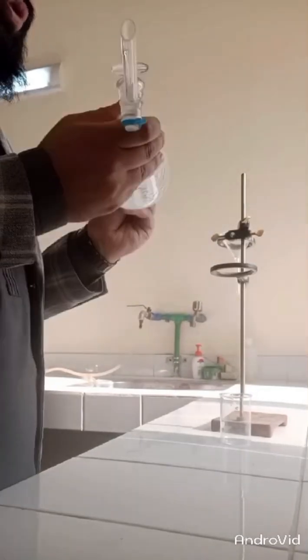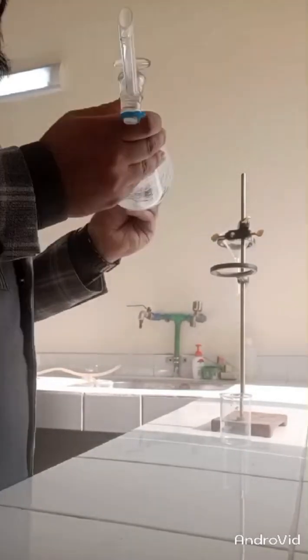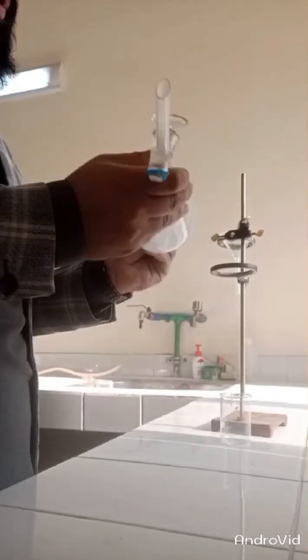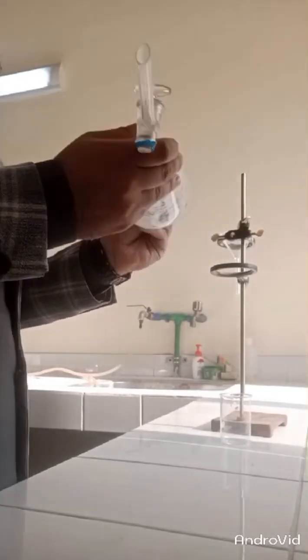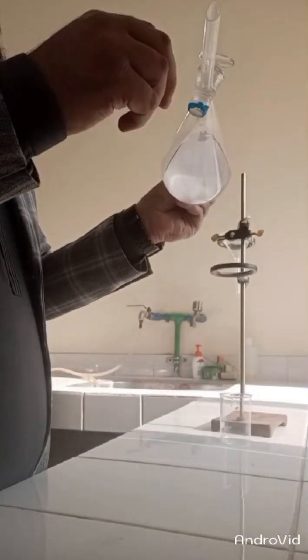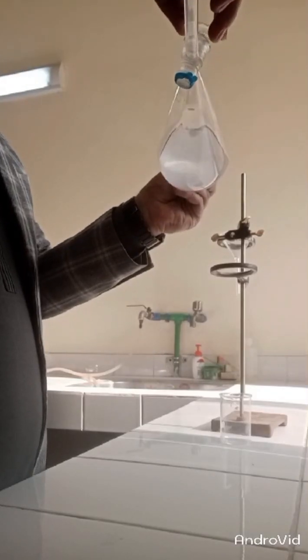Shake it very well so that both the aqueous and organic layers mix well, ensuring every organic particle moves into the organic layer.